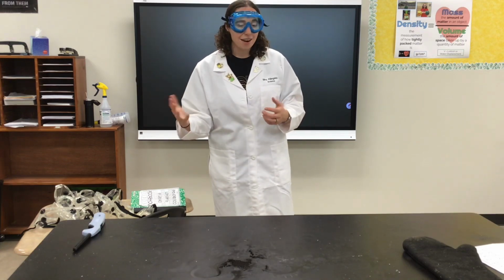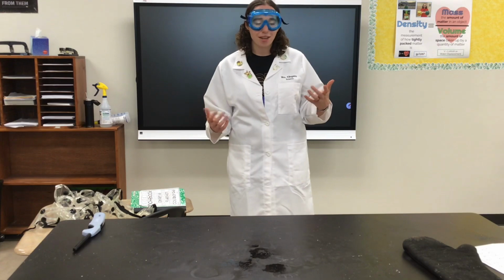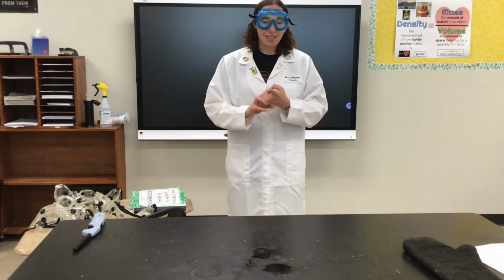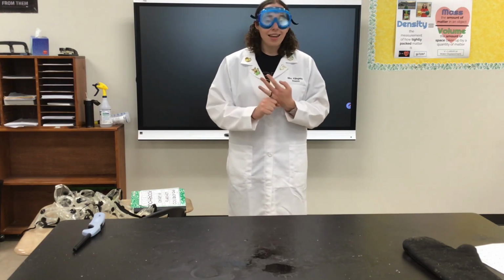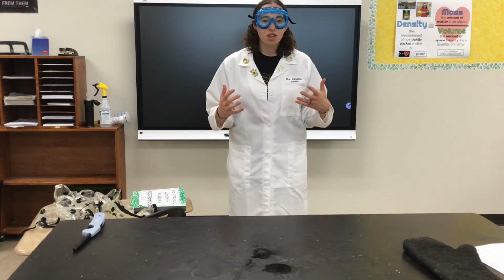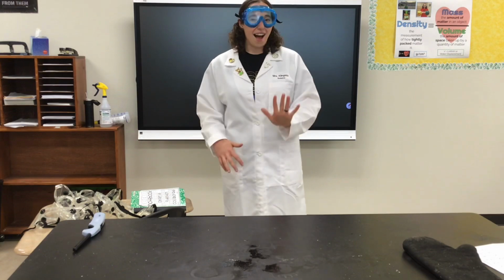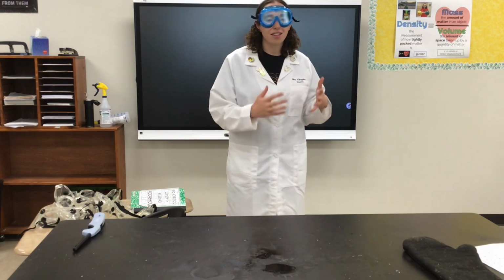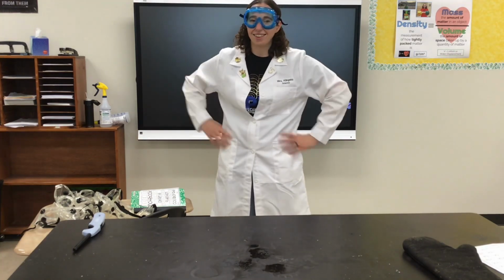new is created. Now, there are different things that let us know that a chemical change has happened, including bubbles, which means a gas was created, a temperature change, a precipitate being made, light being formed, a color change. All these things let us know that something new was created. So we're going to go through 5 different experiments, and I want you to try to see, can you identify what are the things that prove that a chemical change has happened? All right, let's get started.